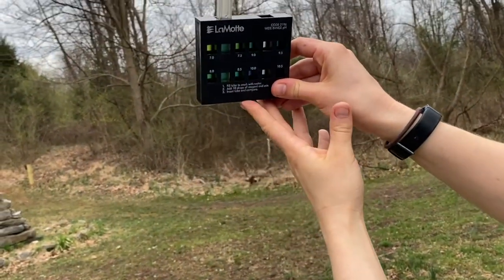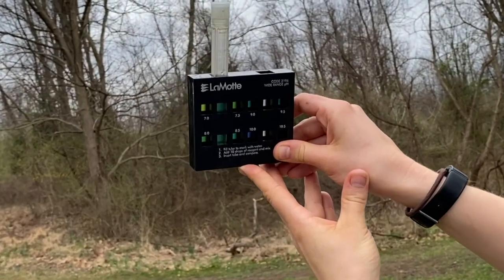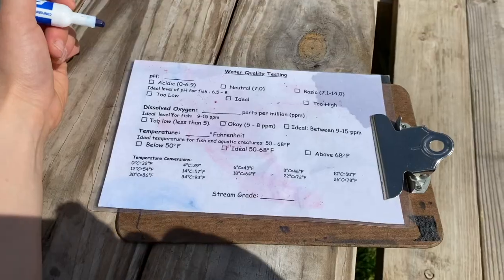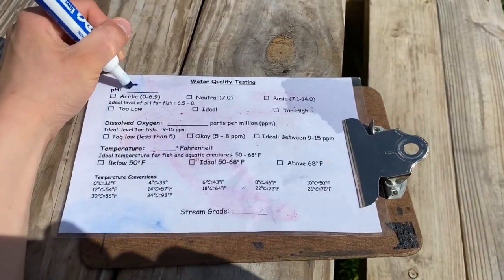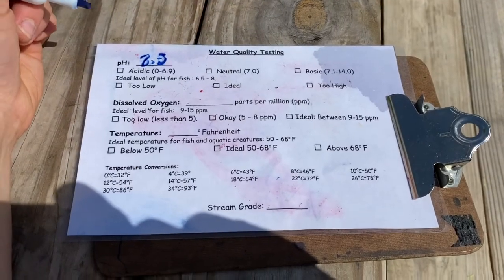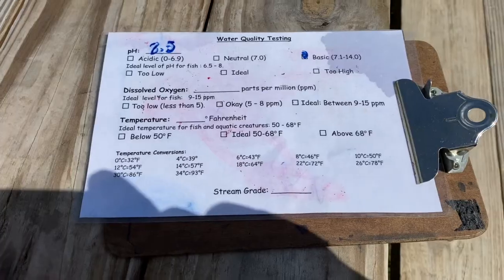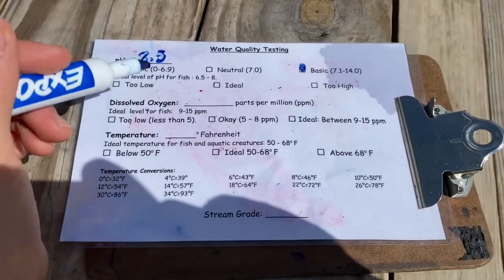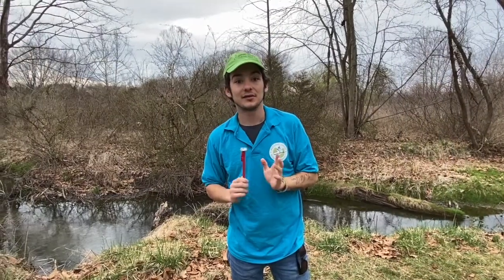I'm going to put the test tube in one of these little blocks and try to match the color. It's helpful to hold it up to the light. The pH looks like 8.5. That is higher than 7, so that's a little bit basic. Is that ideal for fish? Well, fish need a pH between 6.5 and 8, so it's a little bit too high.